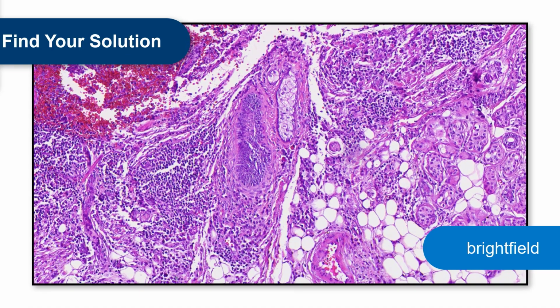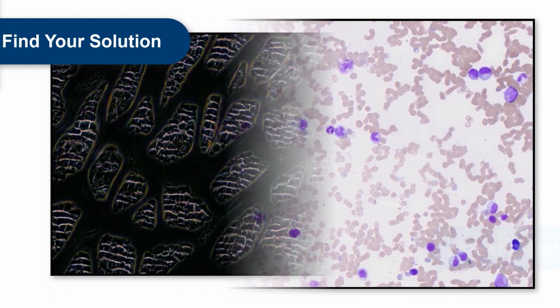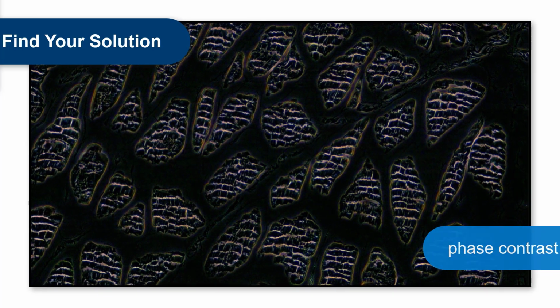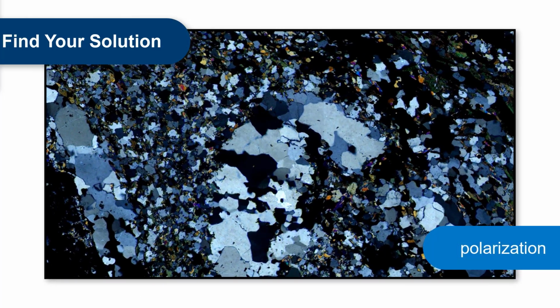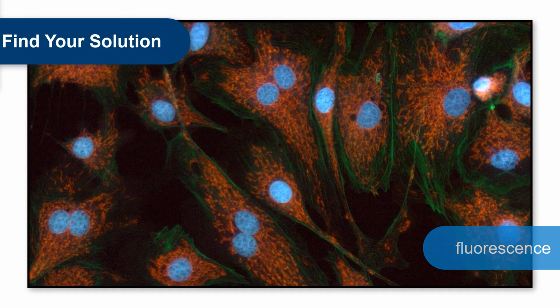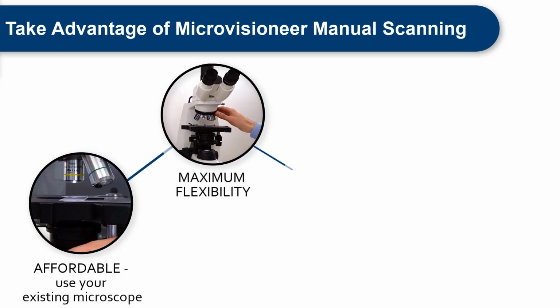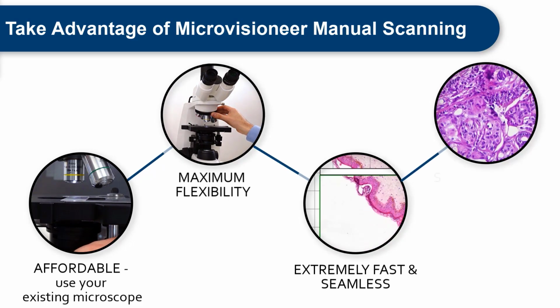mvSlide is exceptionally versatile. Almost any slide can be digitized. Different light settings and contrasts, as well as a wide range of applications, are possible. You decide what to scan. The highly affordable and flexible solution allows to scan unlimited panoramas and create scans of superior quality.